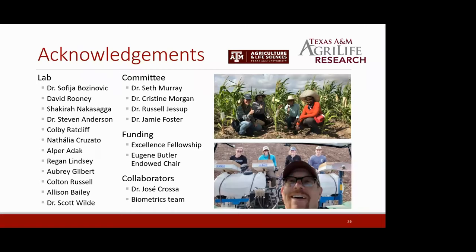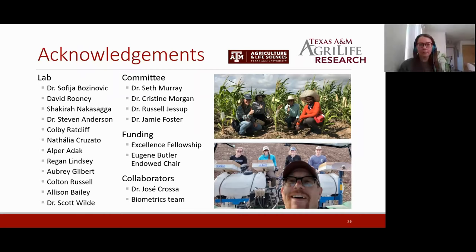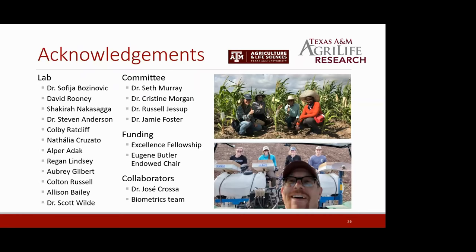And Marcio Resende asks, hi, Holly, great chat and great work. I agree with the assumption of a combination of pedigree and composition leading to high accuracies. The question is, did you look at the accuracies in predicting composition in your CV0? Did the experiment where NIR BLUP had a higher accuracy show lower composition accuracy?